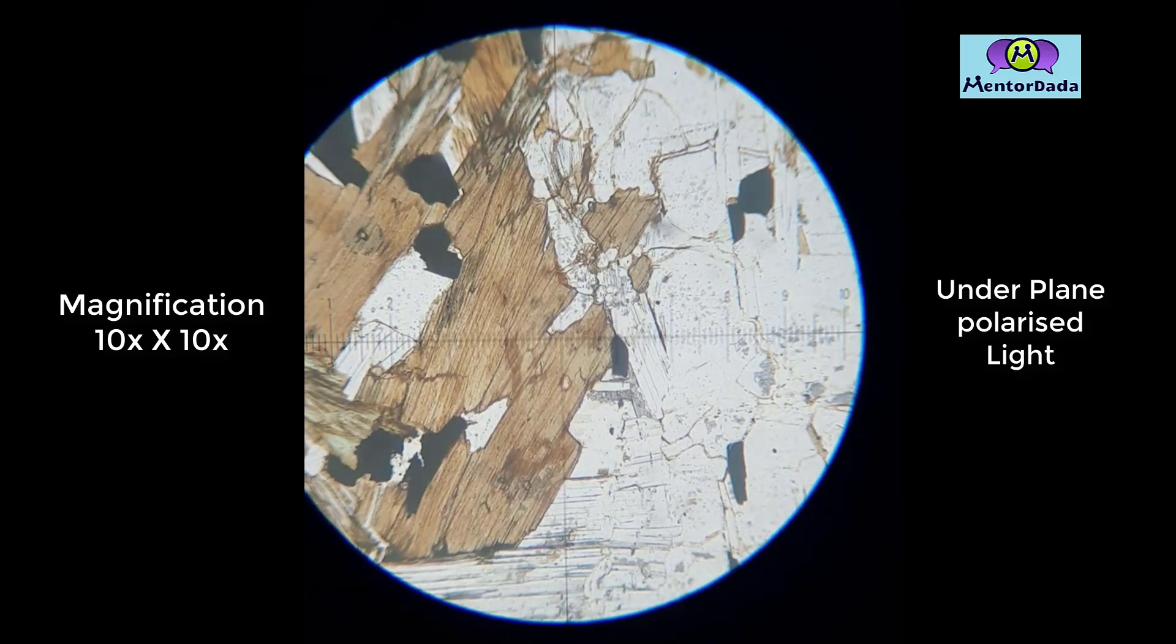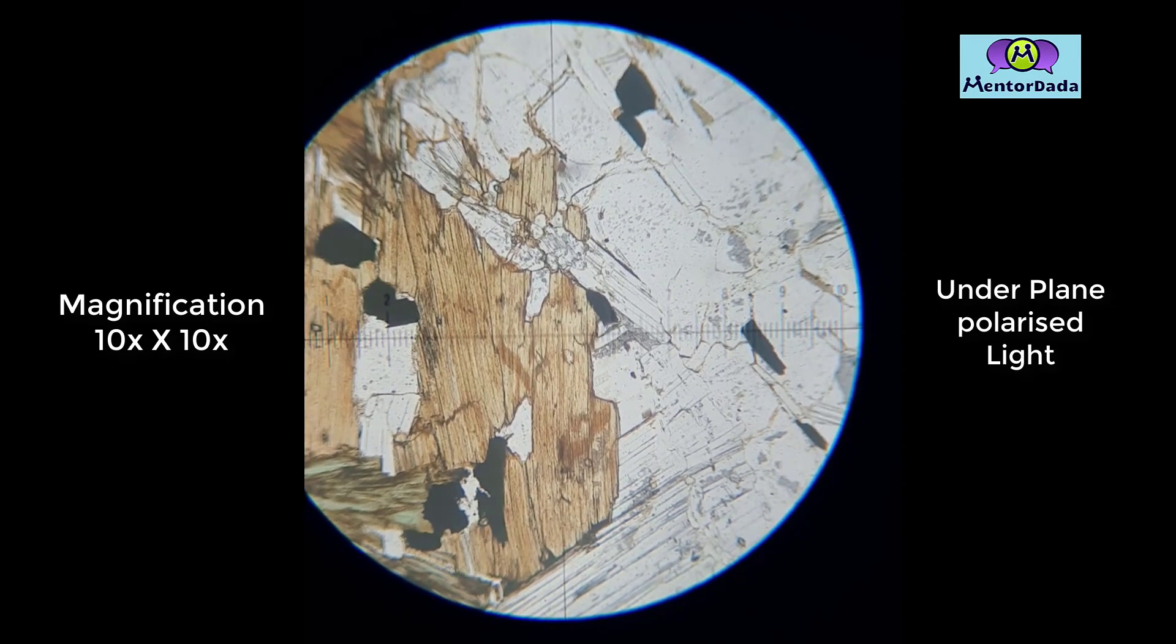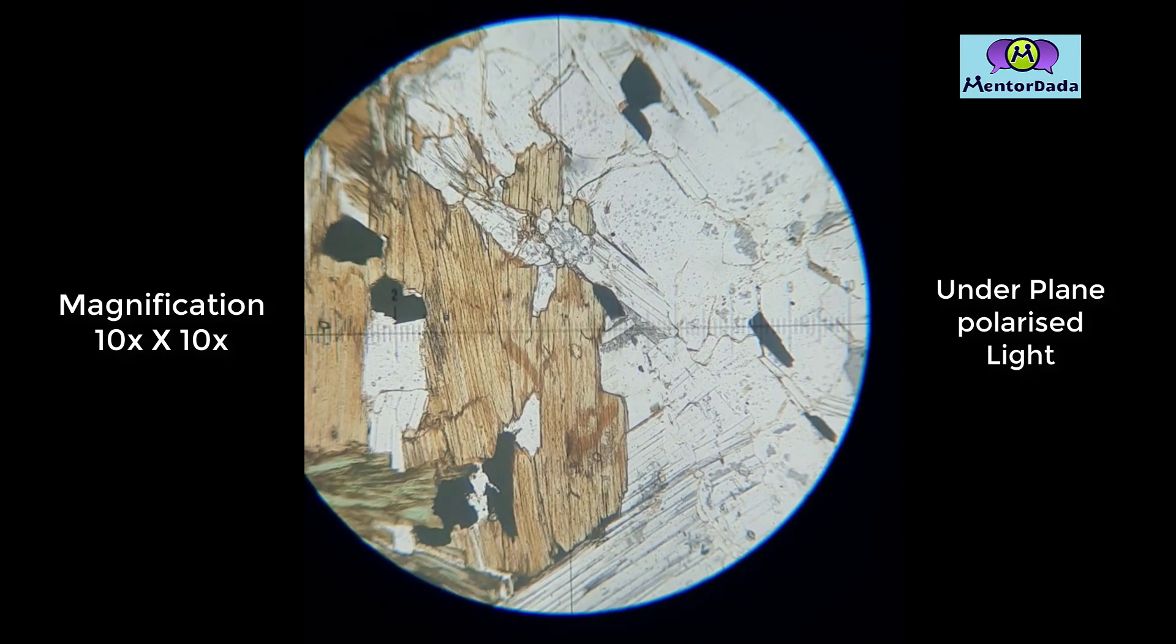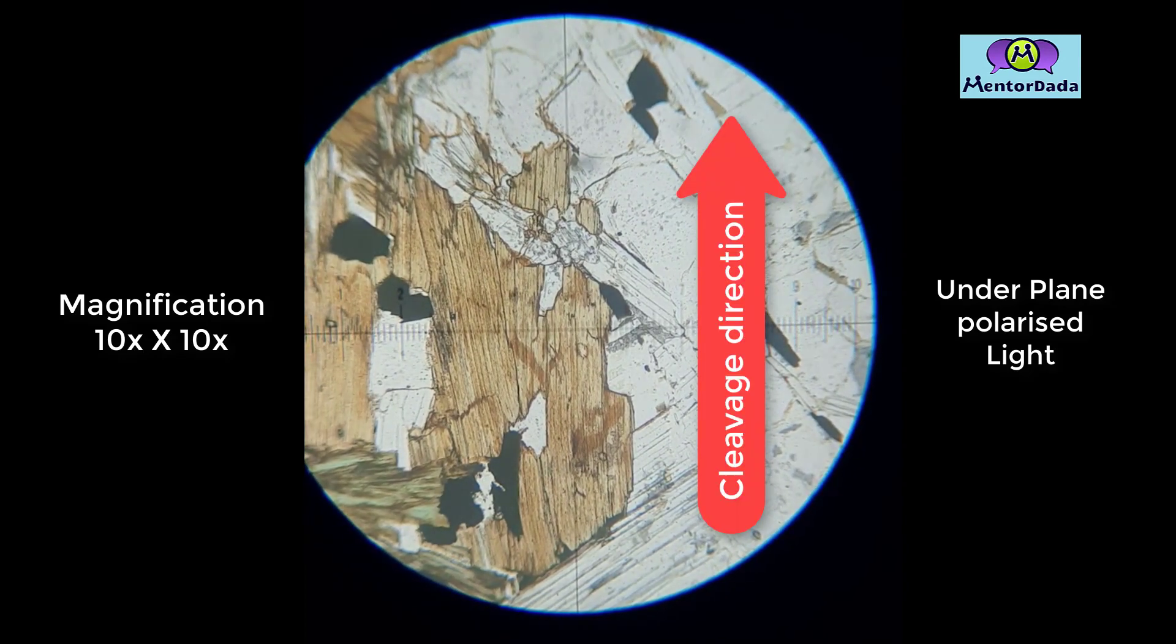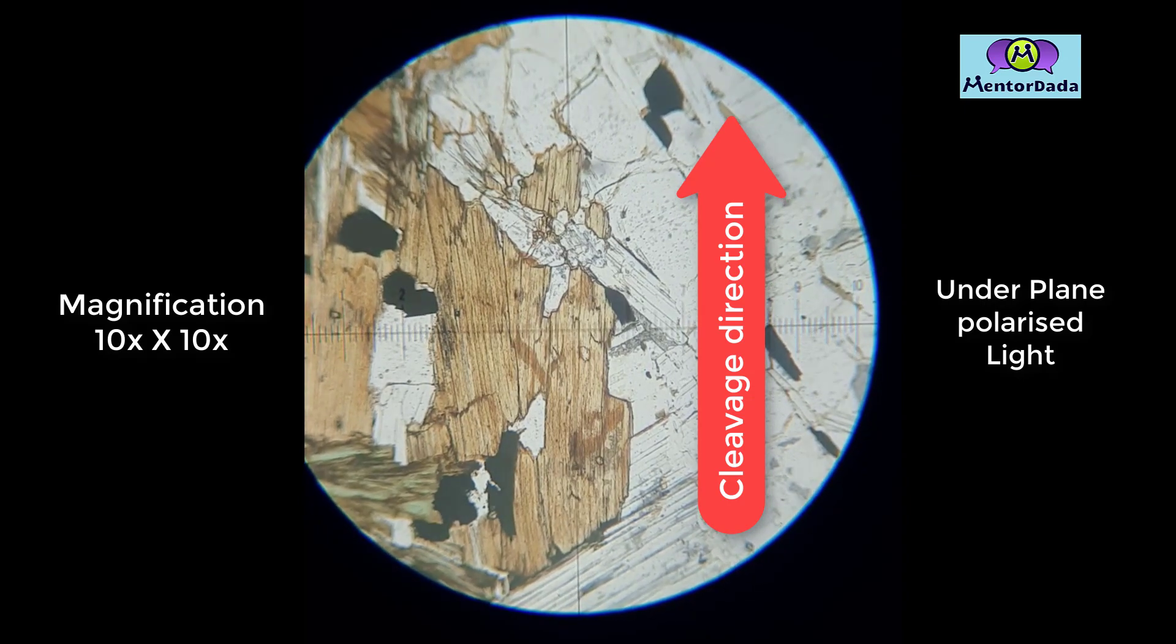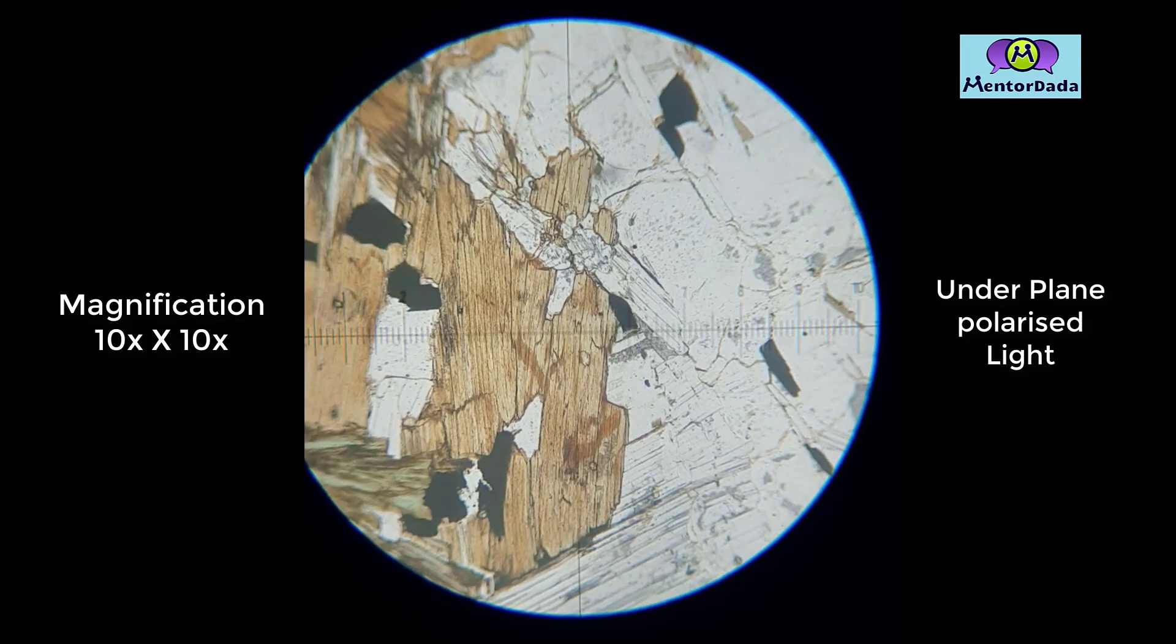Here we can clearly observe one set of cleavage. In this condition, the cleavage direction is aligned parallel to the analyzer, that is in the up-down direction.